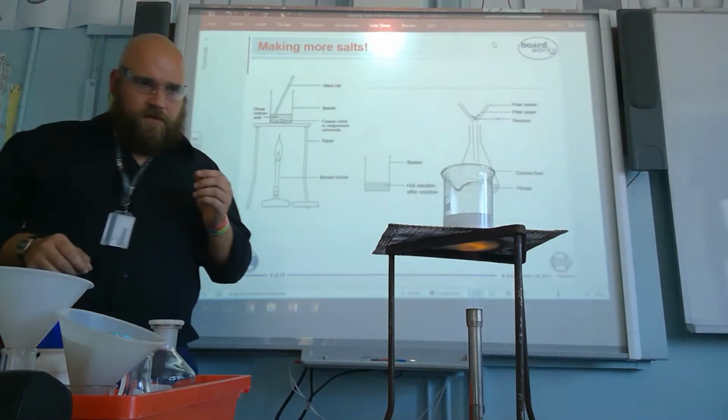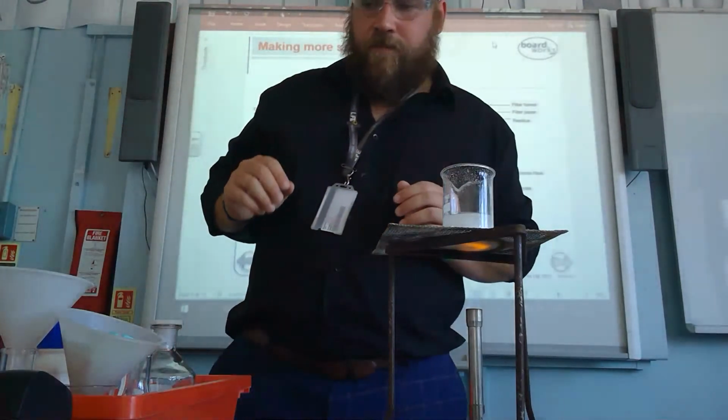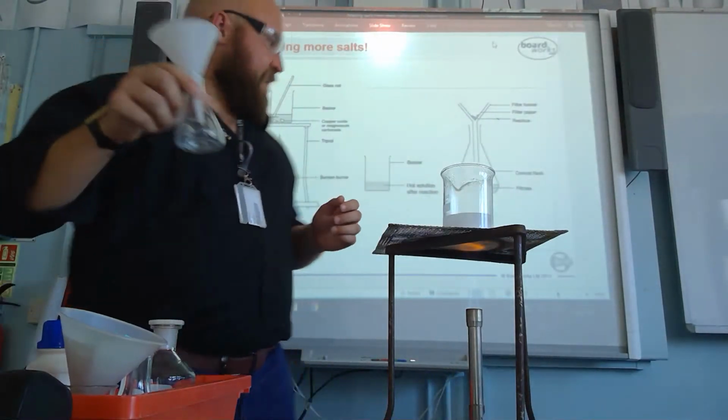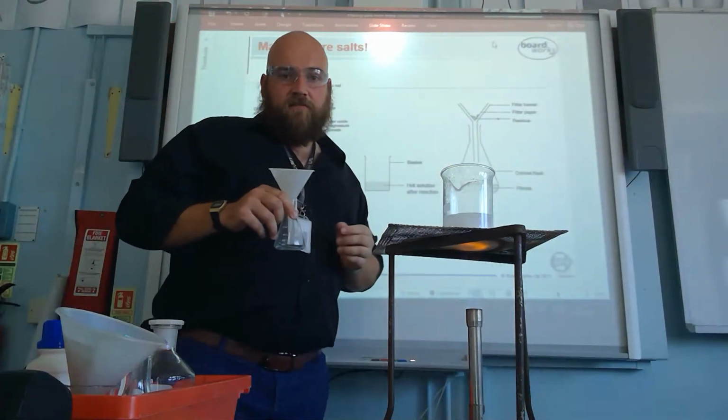Okay. So again, I'm not going to rapidly boil it. I'm just going to get it to bubble and then stop. And then I can start the next process. So here's my, I can start filtering it. So I'm going to filter it and then I'll do the recrystallizing.